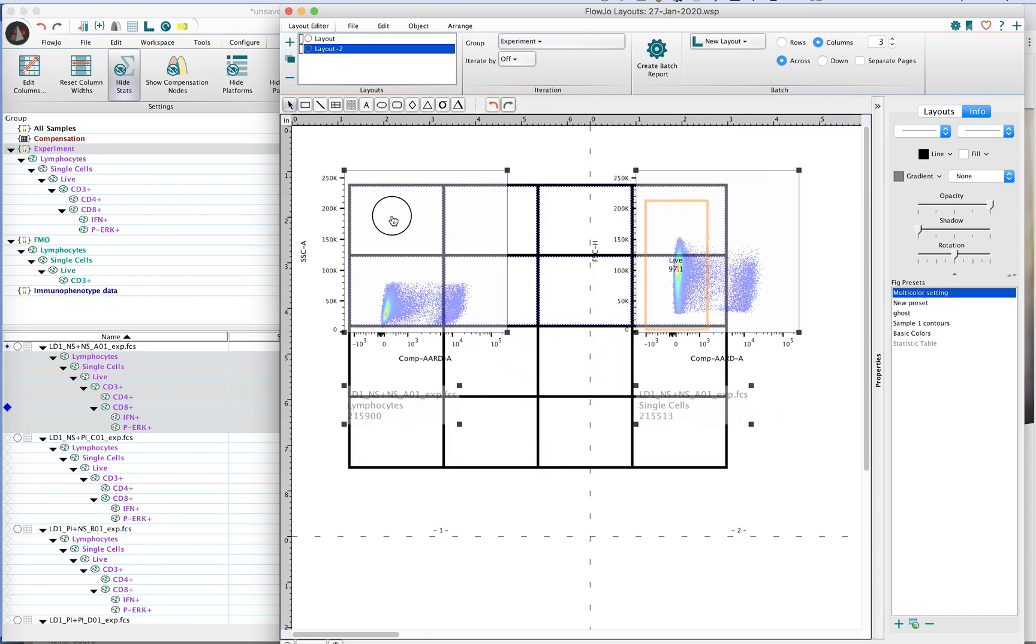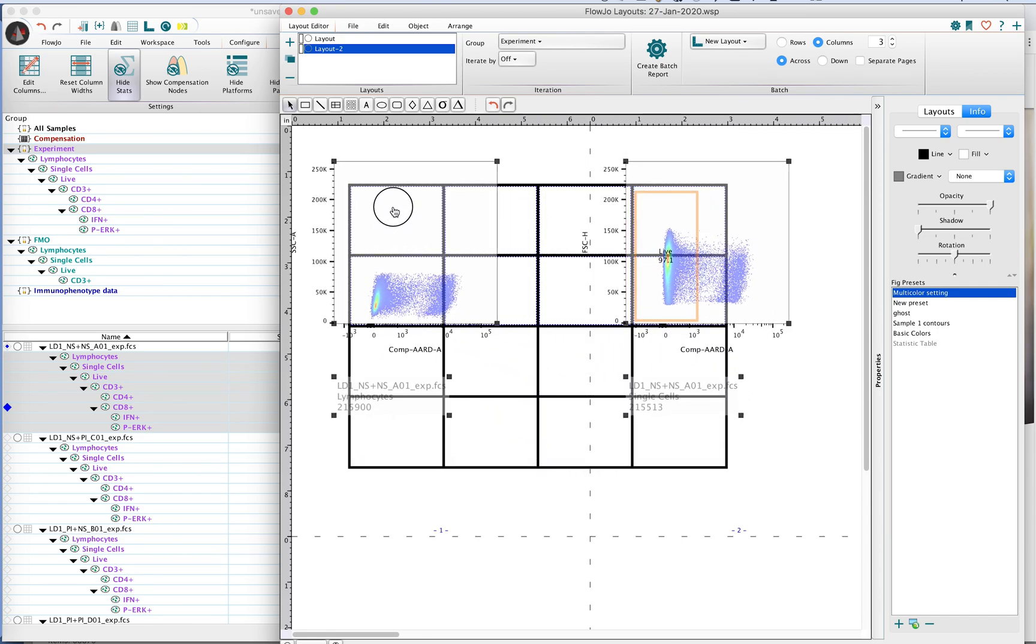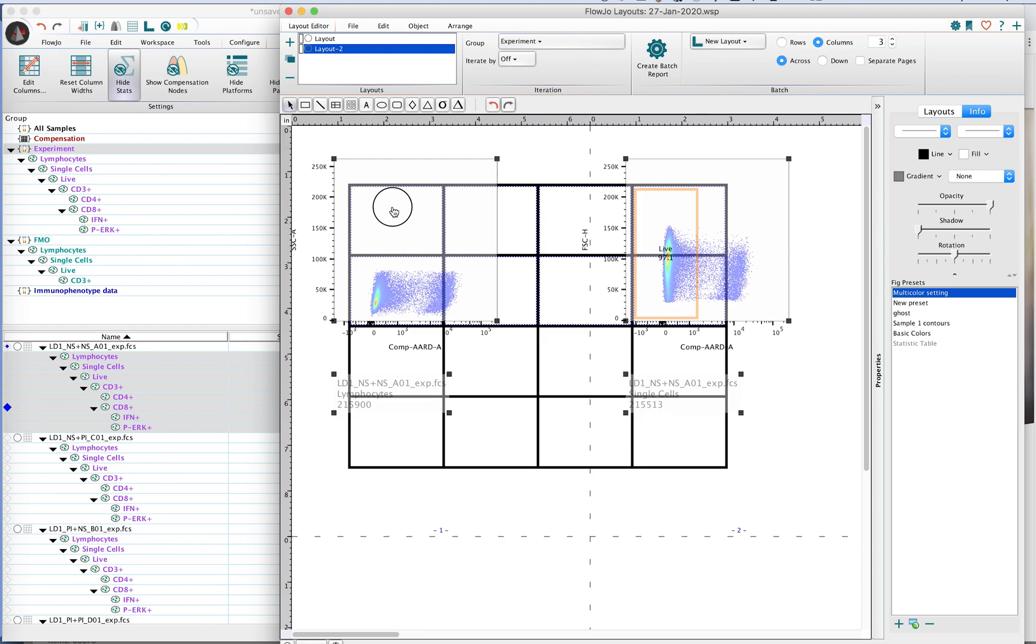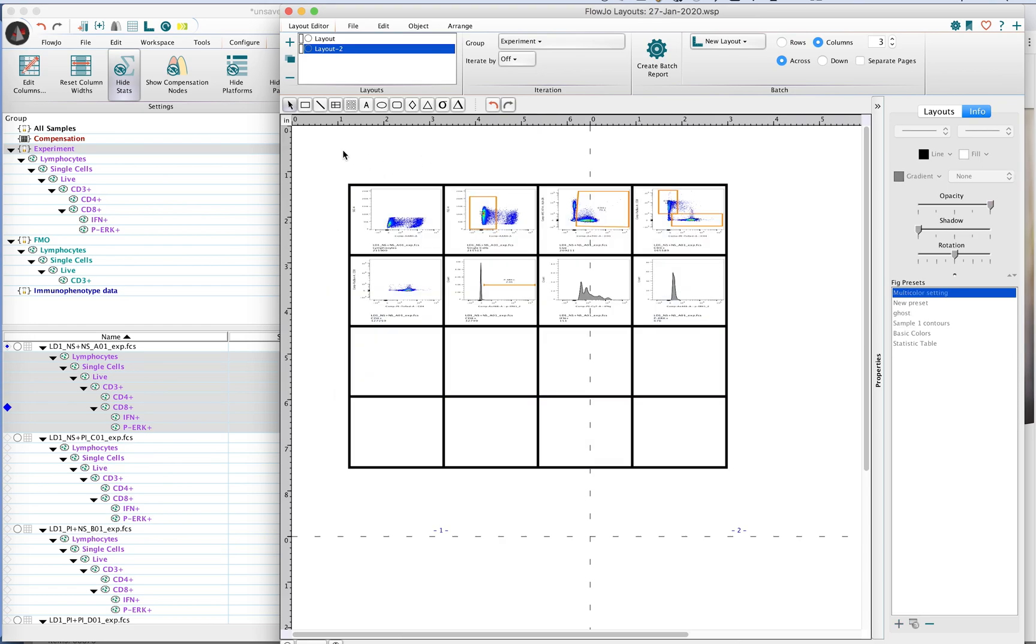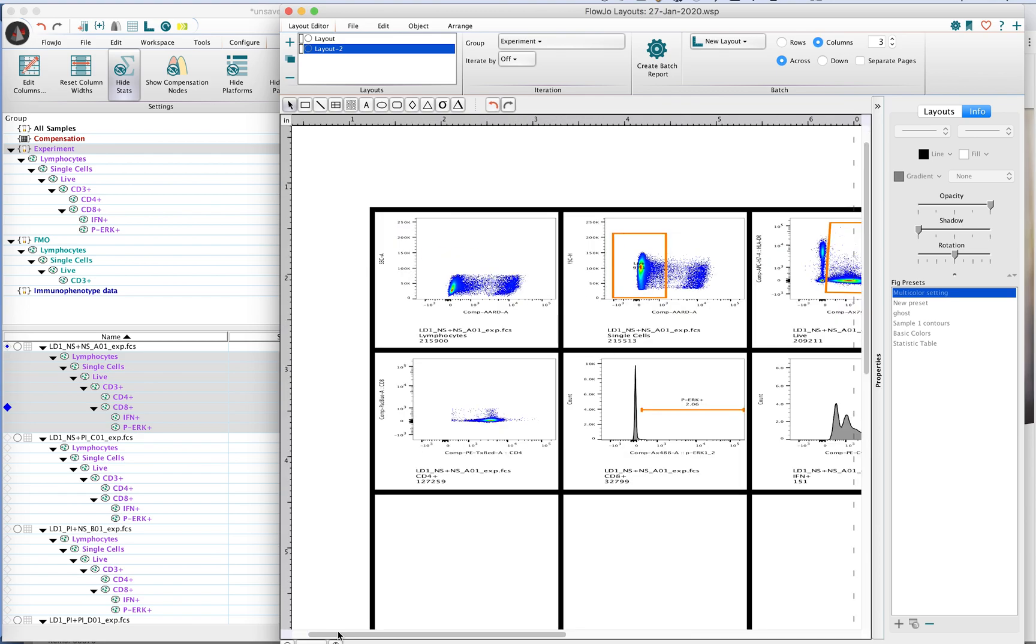Then what we do is we drag our plots again, targeting that upper left quadrant or upper left square. Now when you drag in your plots, you will notice that you have all of the axes labels as well as the little legend that goes down in the bottom.